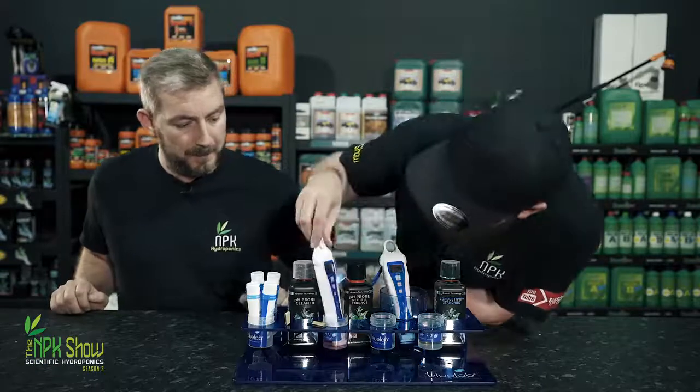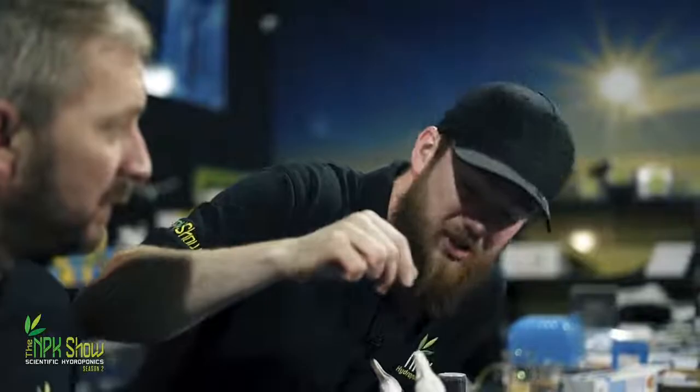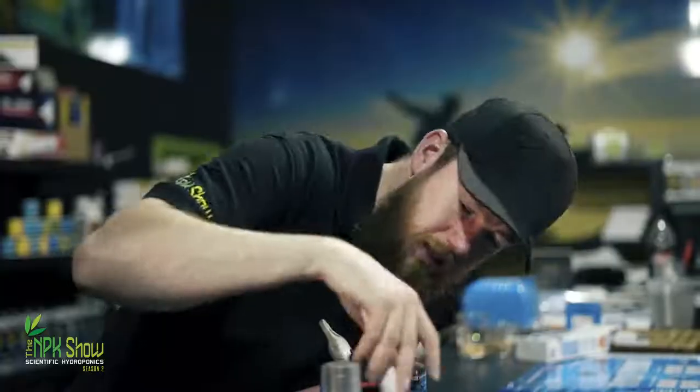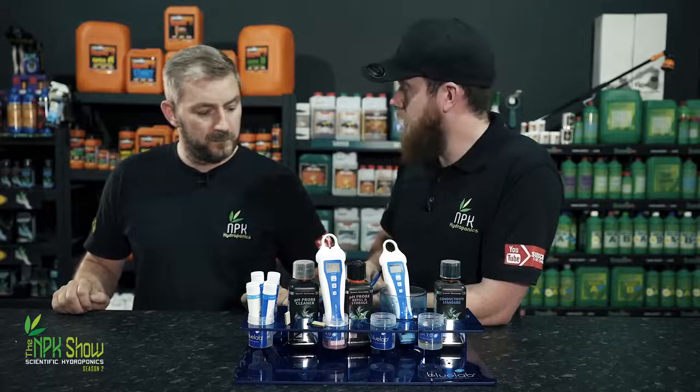Yeah. So we've settled on 4.2. Again, you'll probably show a bit more patience than that. Maybe wait a little bit longer, see if it gets down to 4.1. But we'll calibrate at 4.2. Let it do its thing, and then your pen is ready to go. Put it back in the box, and you're happy days.